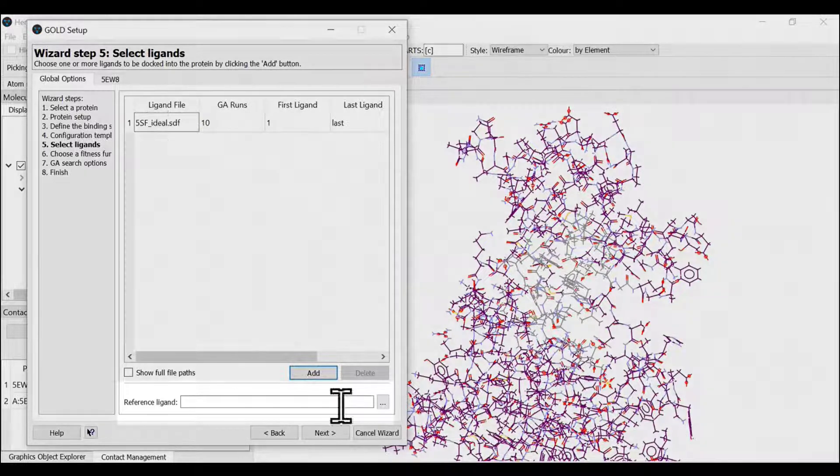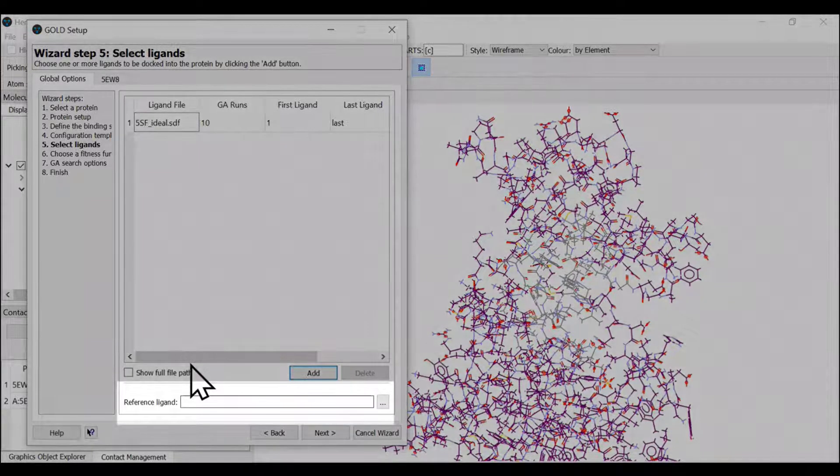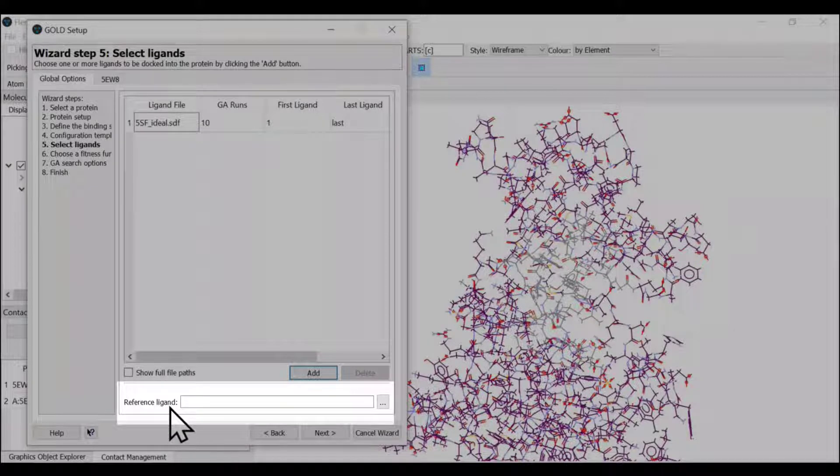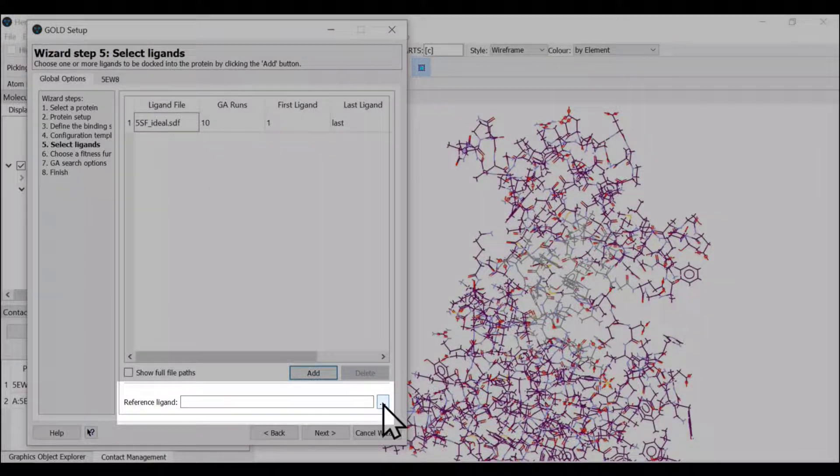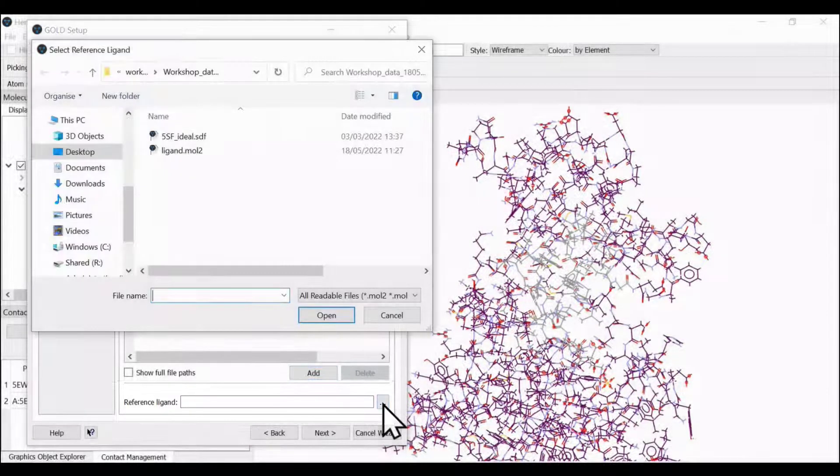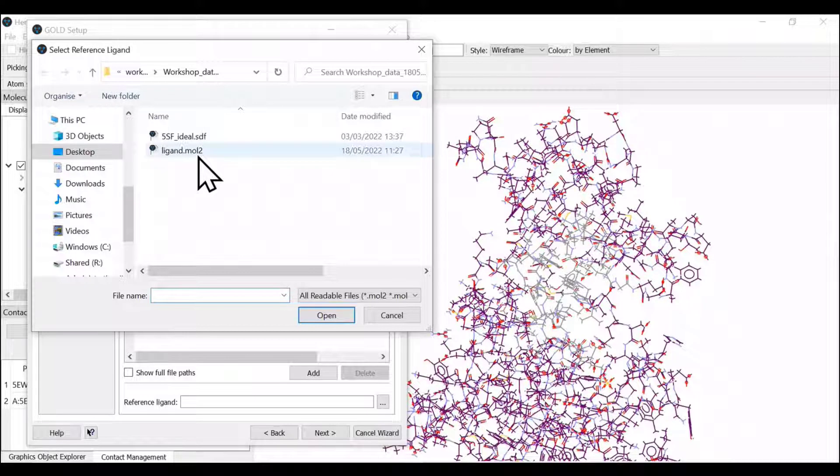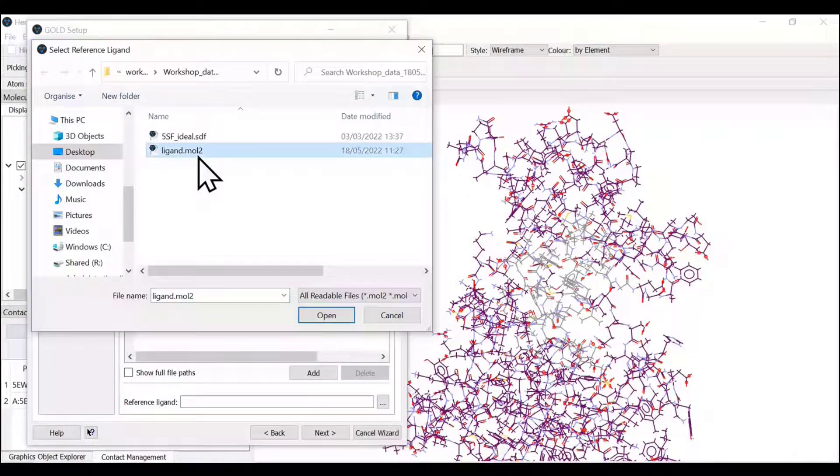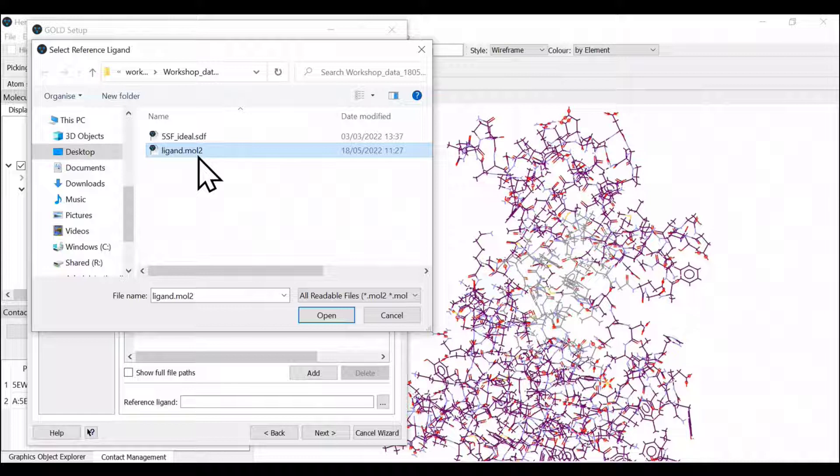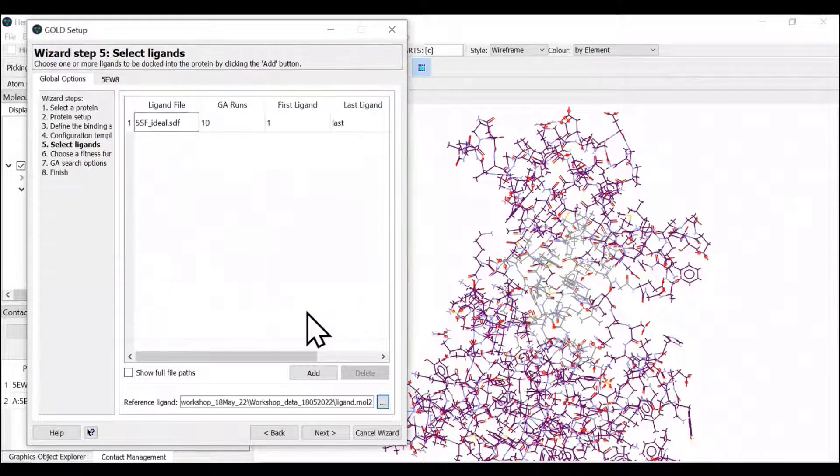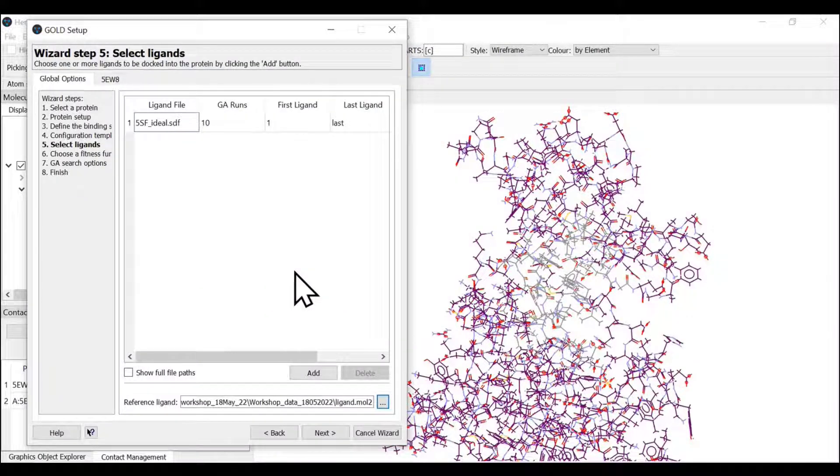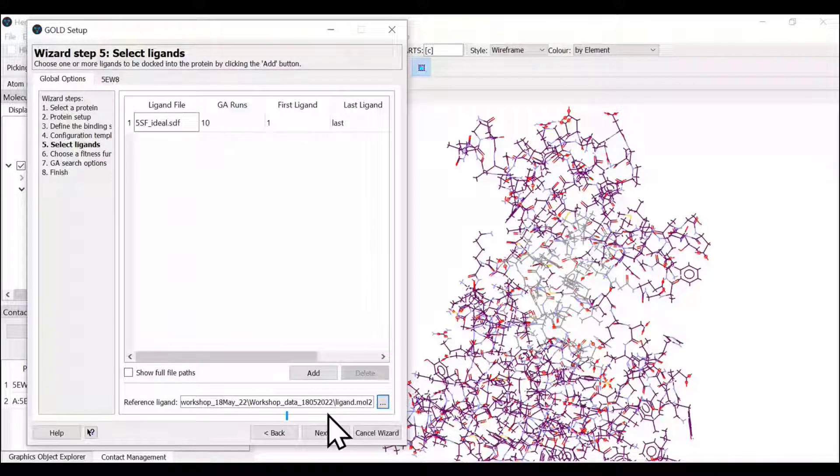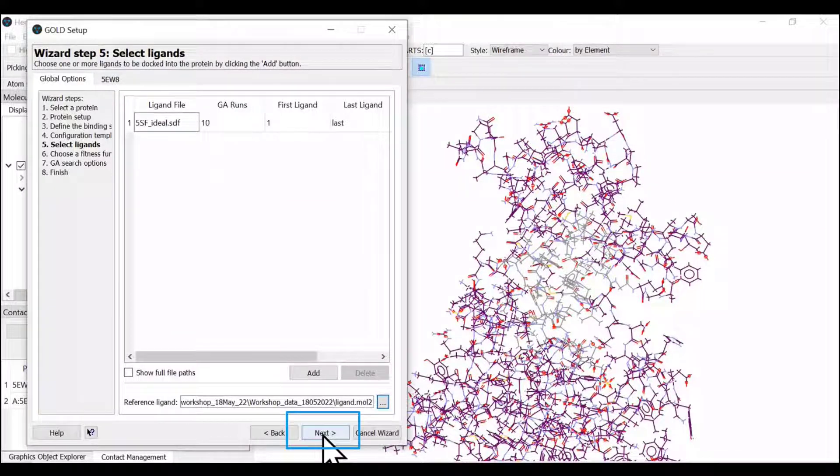We can also provide a reference ligand so we can calculate the RMSD after the docking calculation. We're going to select the ligand.mol file that we saved in the protein preparation step. Here we go—we now have the ligand to be docked and a reference ligand. Let us go to the next step.